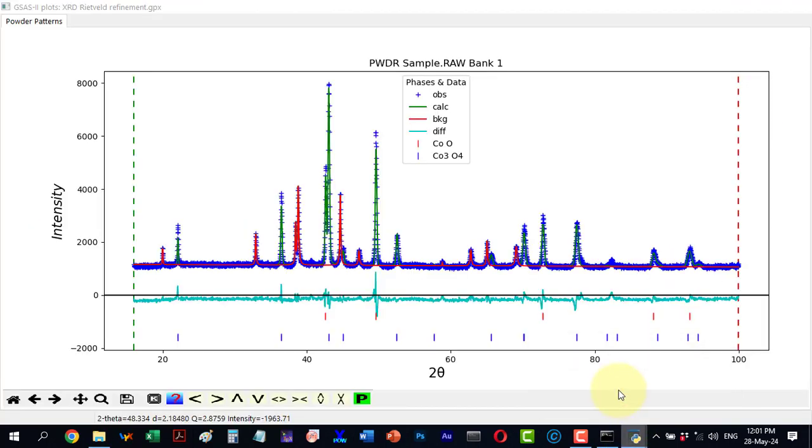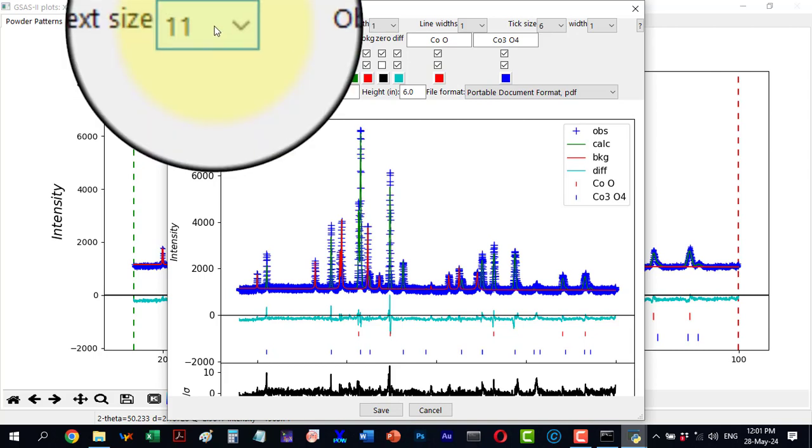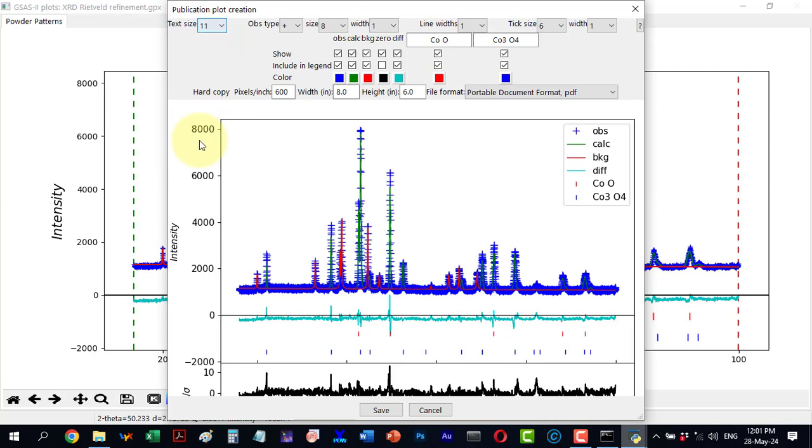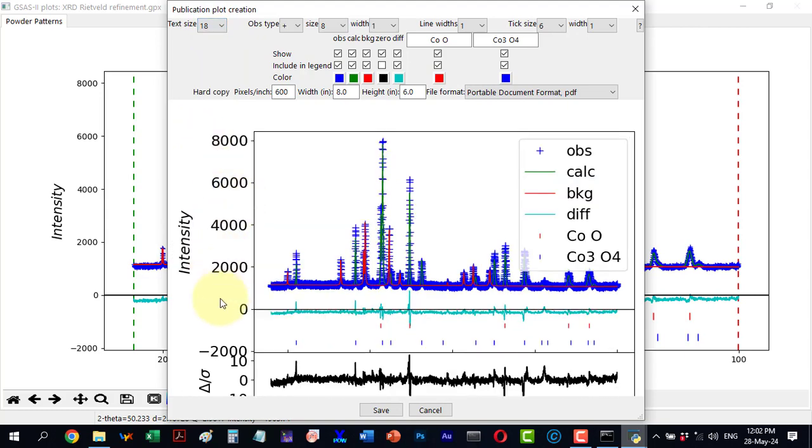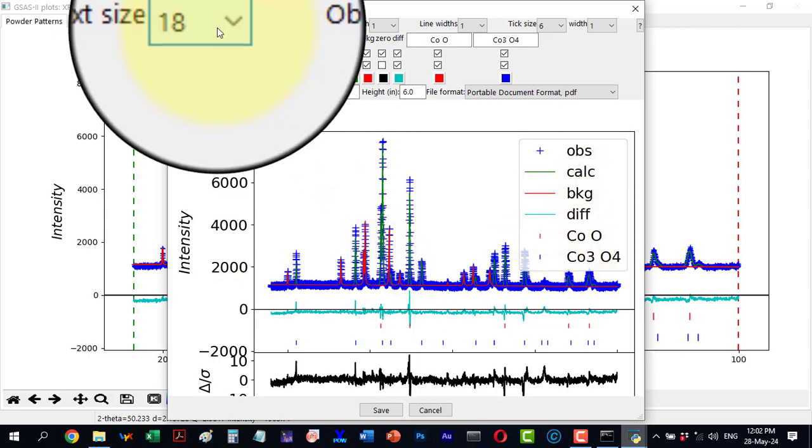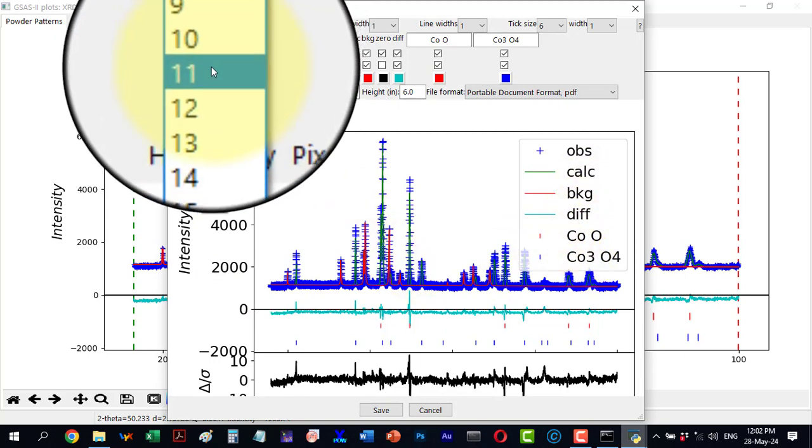Another way is to customize the export. To customize, I click the P symbol again and a detailed menu appears. I will start from the first option which is text size. The default value is 11, affecting all texts in the plot. For example, if I change it to 18, all the text will be updated. I will revert to the default value.